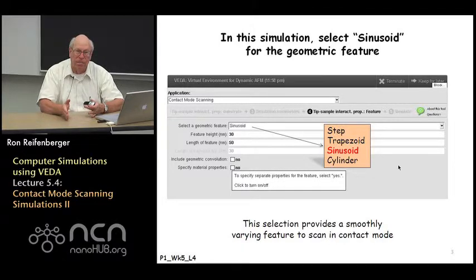There's big errors associated with the Z piezo motion in those two extremes. In between, when the tip is scanning over the middle of the sharp step, the set point conditions are well maintained, and you've got an accurate representation of the topography.